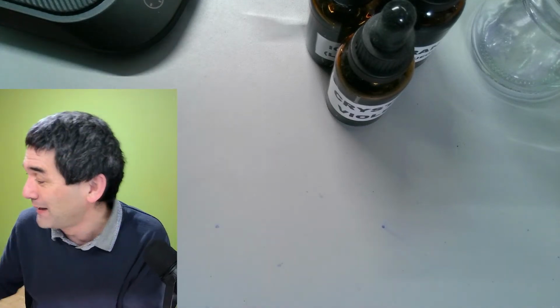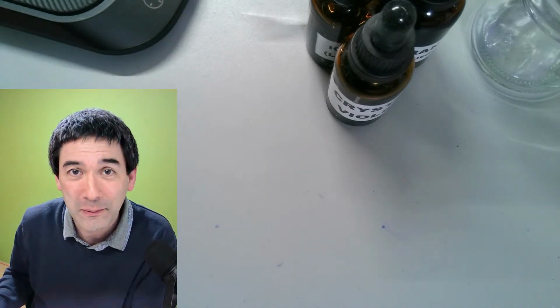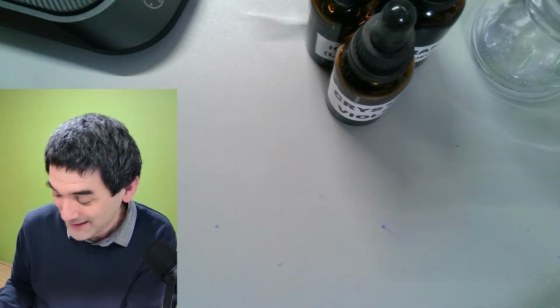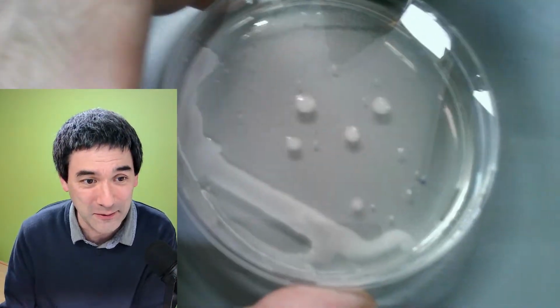Okay, and I'm going to show you the Petri dishes here. I wanted to throw them out, but then I said, well, actually, maybe it's an advantage because now I can do some gram staining. So I'm going to show you the Petri dishes that I made. And honestly, this is an embarrassment. Okay. Look at this here.